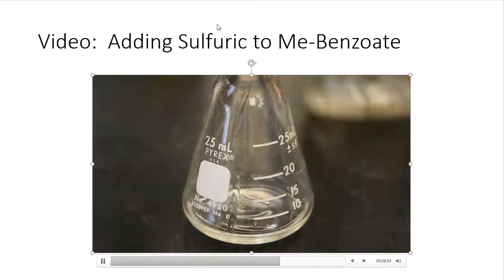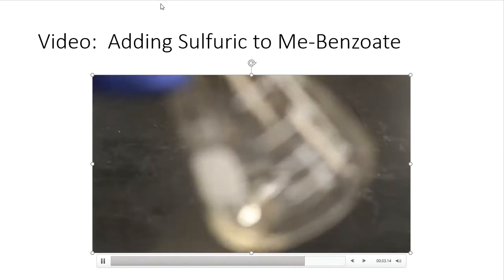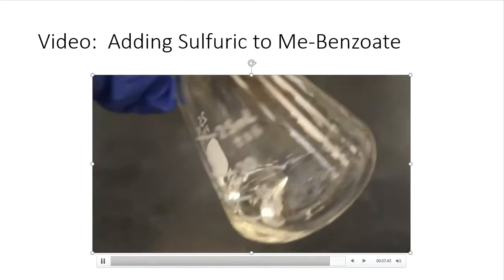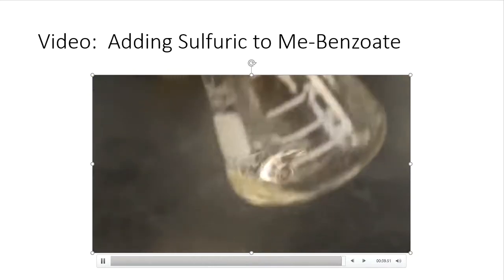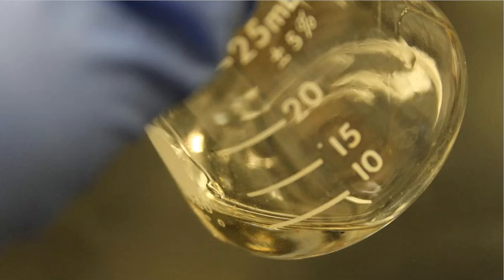Well, that was kind of boring. No one said that organic lab was very exciting every single time. So I didn't really see anything happen. It just mixed together. It's still clear. It didn't change colors. It didn't really produce steam. It didn't produce a precipitate or anything. So once again, here is a close-up picture of what that looked like with the addition of sulfuric.